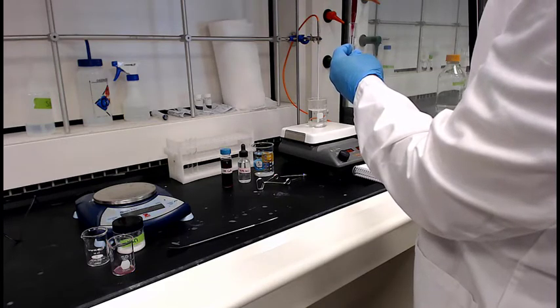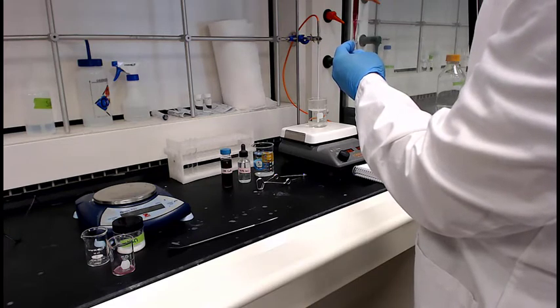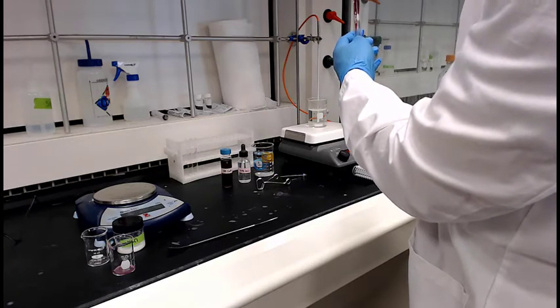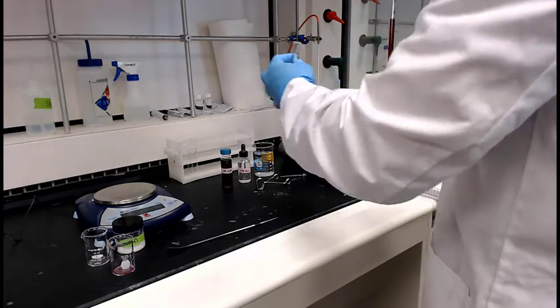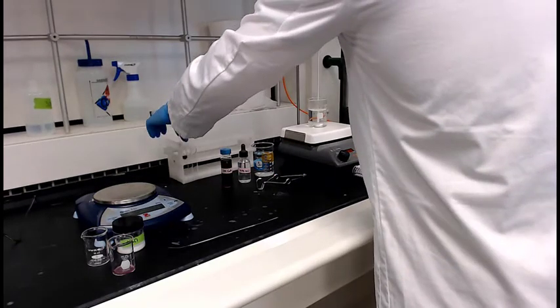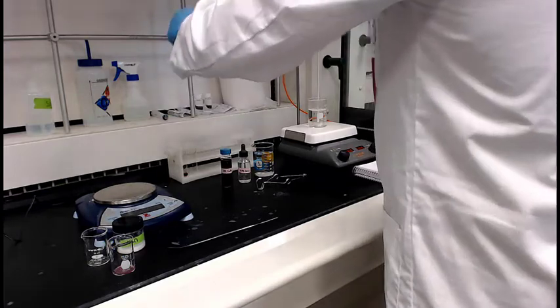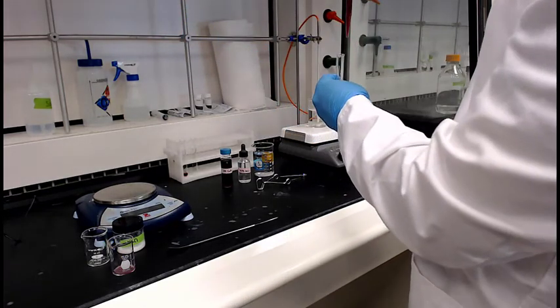It's not much, just a little 1/2 mil in there. Here's tube 2. This is going to be our color reference. This is going to have the 2 mils in it.